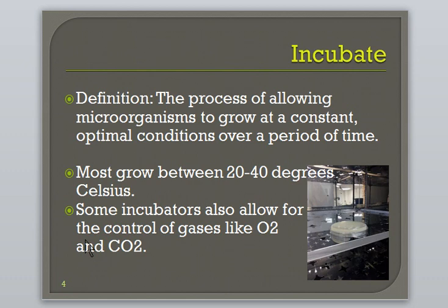After the medium has been inoculated, we must allow it time to grow or to incubate. Microbes should be incubated at their optimal conditions. Such conditions as temperature, oxygen, etc. need to be considered.